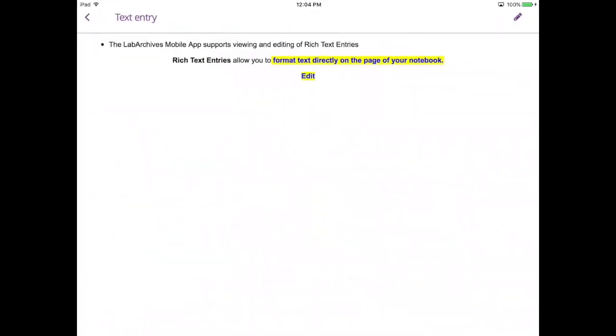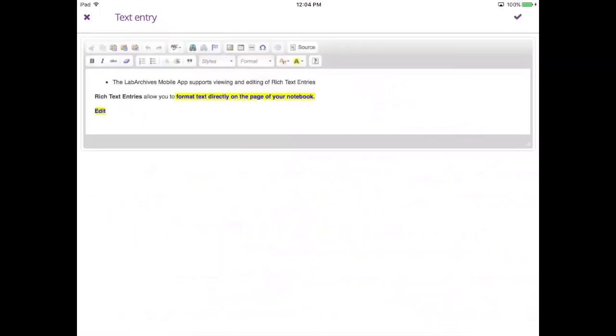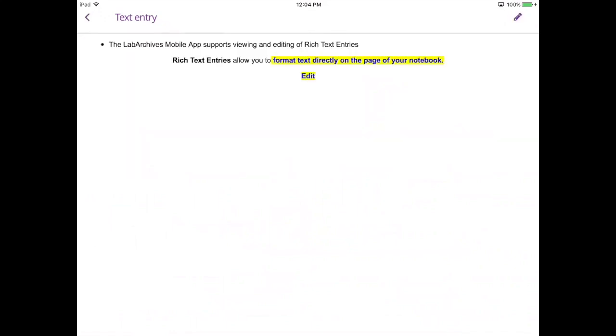To edit entries like rich text entries, headings, and plain text entries, tap the pencil icon on the top right. If you would like to cancel your edits, tap the X on the top left. And to save, tap the check on the top right.